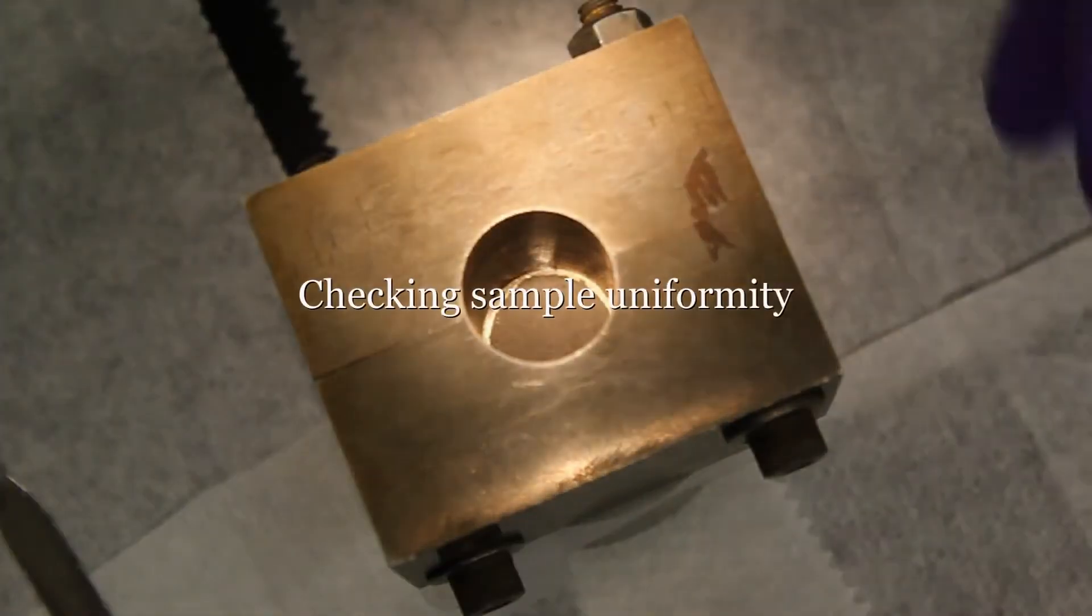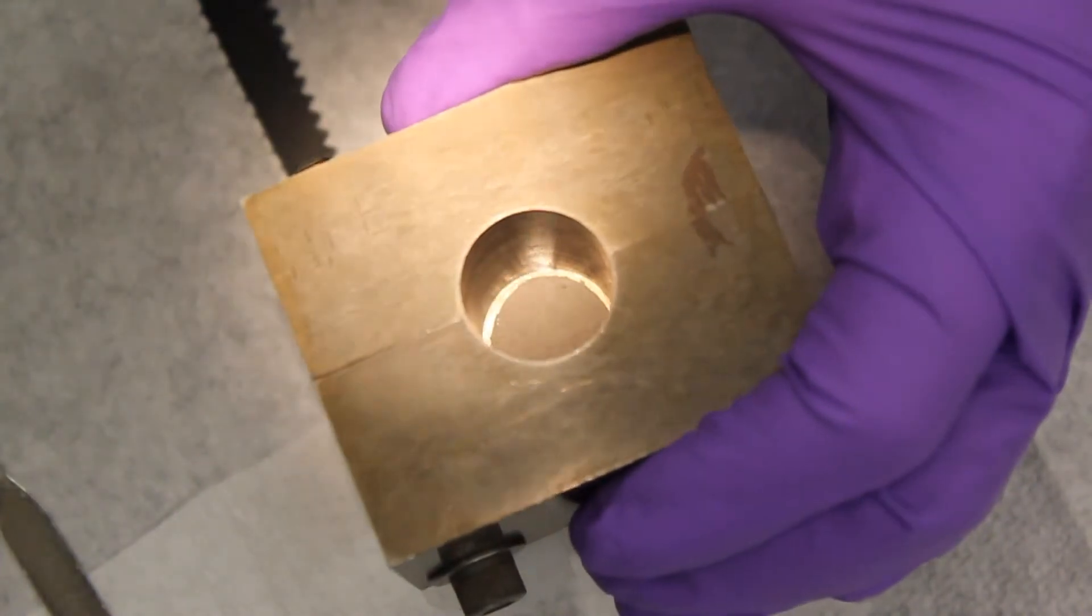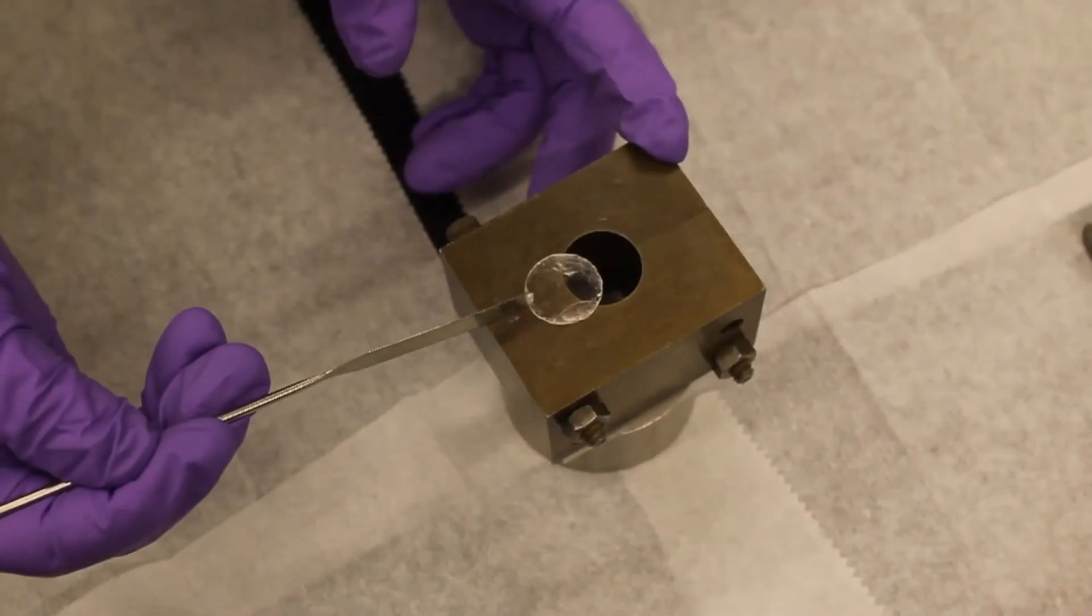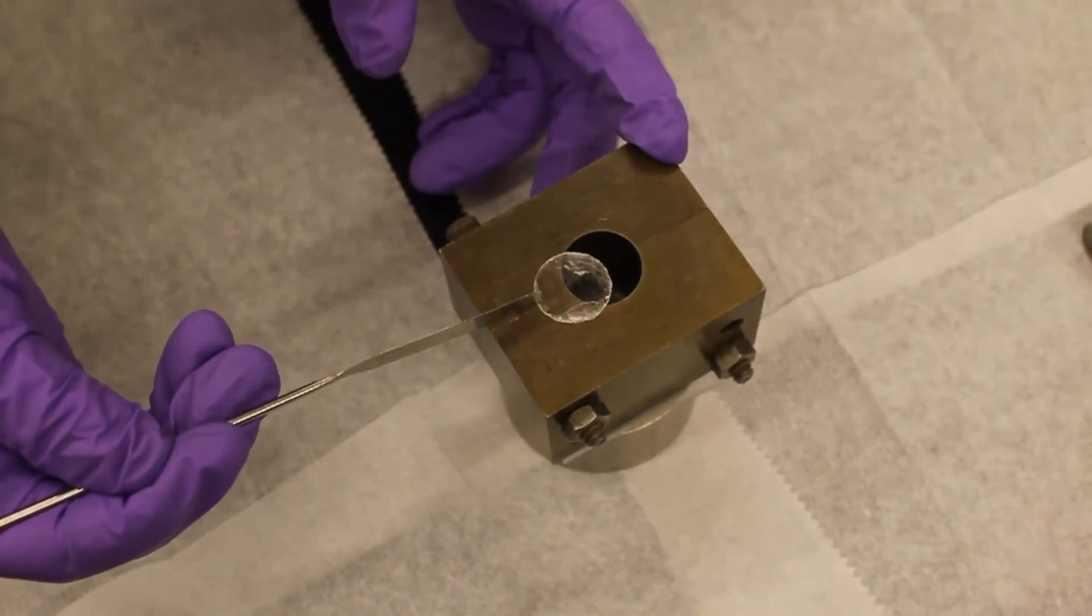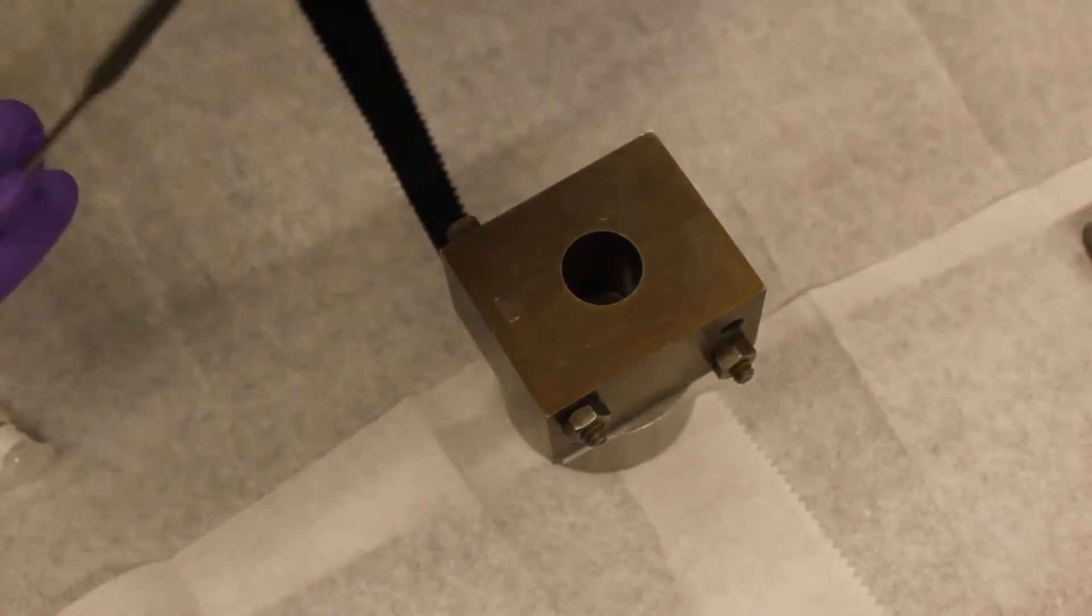To make sure the sample is uniform, you can lift the die up and look through the mica to make sure there's no light coming through your sample. We're going to put another piece of mica on top of the sample. In this process, make sure the mica does not change the uniformity of the sample.